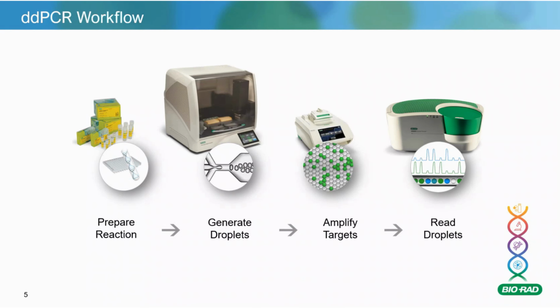Then once you've got your droplets generated, you move them into a thermal cycler. This is a standard thermal cycler, probably one you already have in your lab, or you can use one that you're purchasing, and you do the thermal cycling process. That's a standard thermal cycling process.